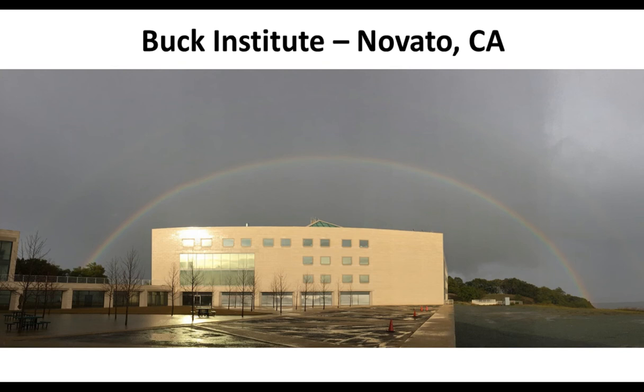The reason being that the only thing one has to consider is that the workflow and the solvents and buffer work for all the antibodies that would enrich the specific PTMs. As Matt mentioned earlier, CST antibodies are also available for ubiquitination and methylation, and they use a very similar set of conditions to perform the enrichments.